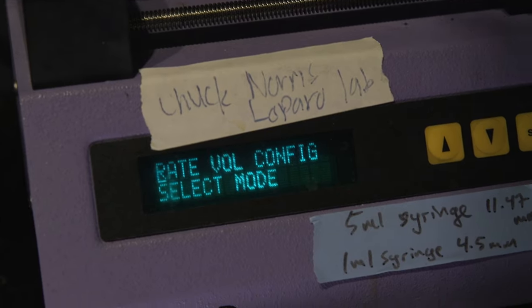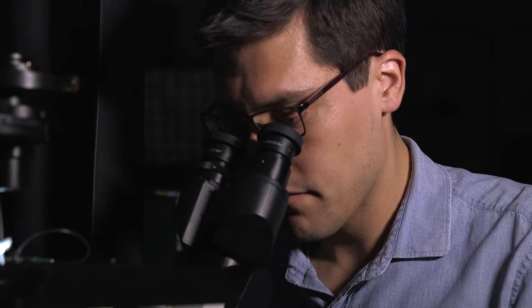So Chuck Norris is a tough guy who gets stuff done. And we like to think that the data that we can produce using this microscope really gets to the bottom of our questions.